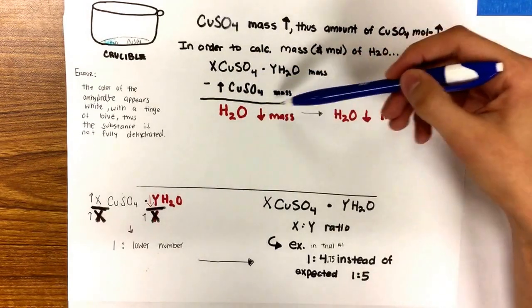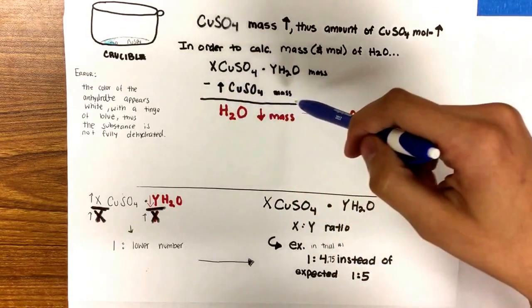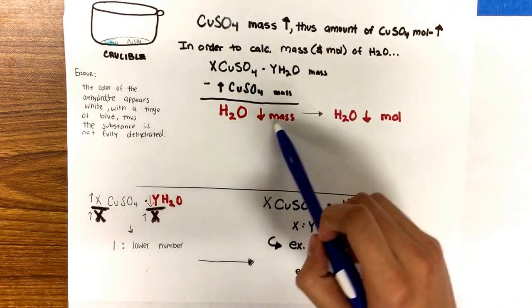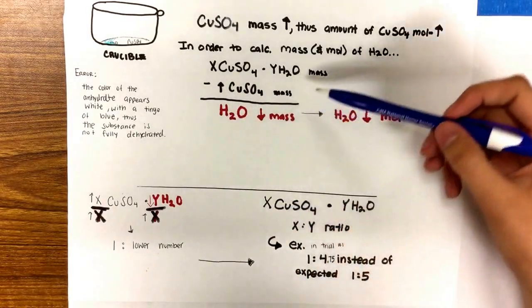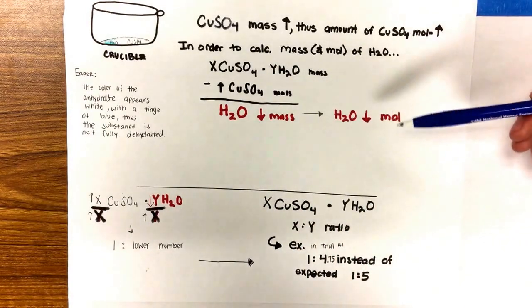This is increased because the student perceived the tinged blue substance to be completely dehydrated when in fact it was not. Therefore, the water mass would be decreased because more is being subtracted from the total, and when you convert it to moles, the moles is decreased.